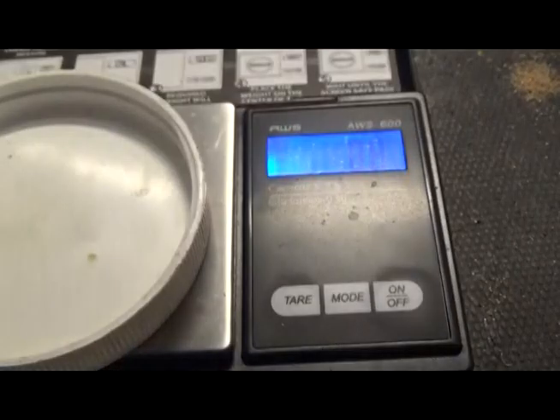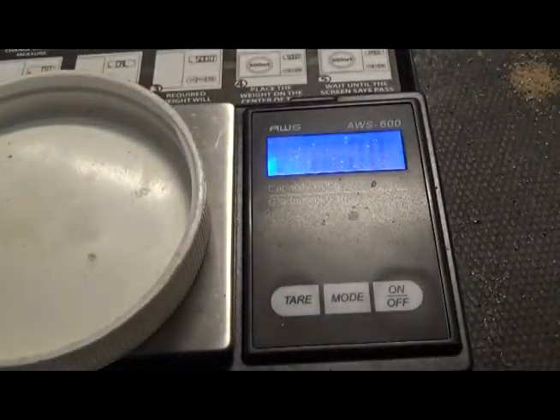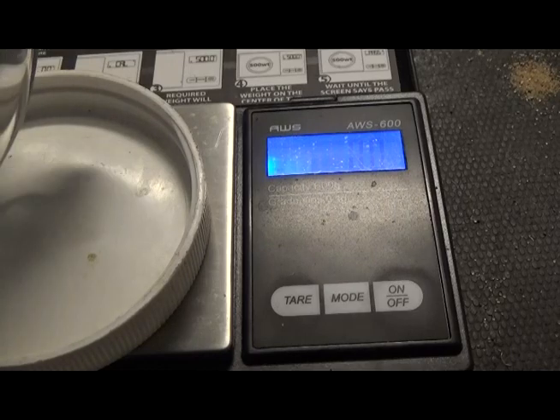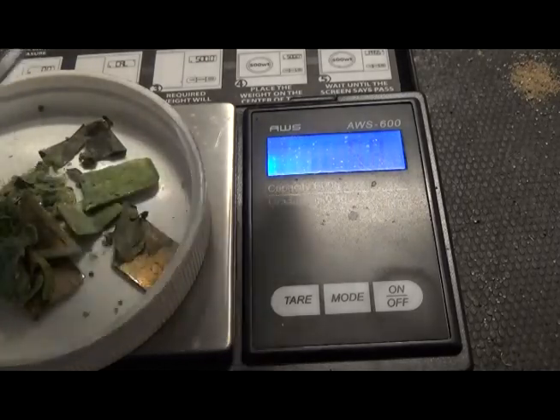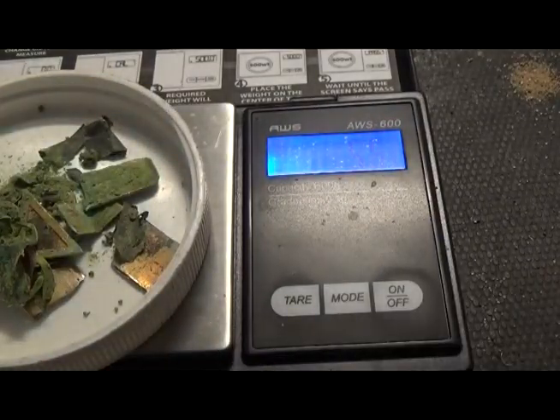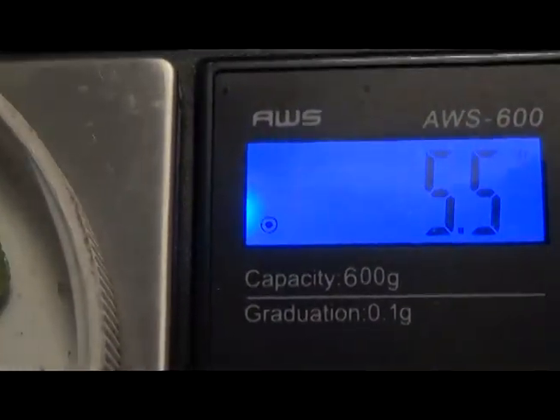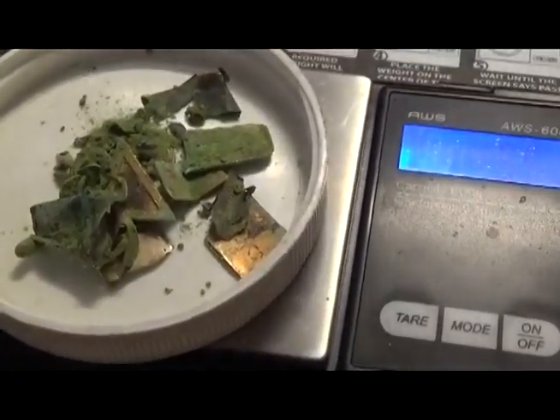Now for the half blend. This is obvious — this is going to be the lightest. Holy crap. 5.5 grams. 5.5 grams — almost half of the weight has been eliminated by this solution.